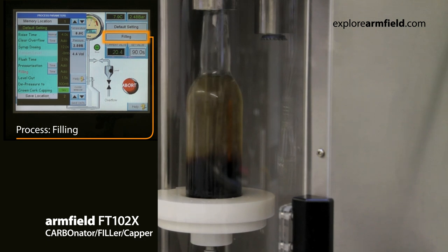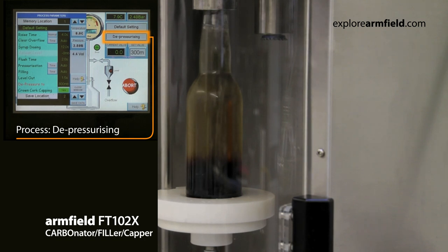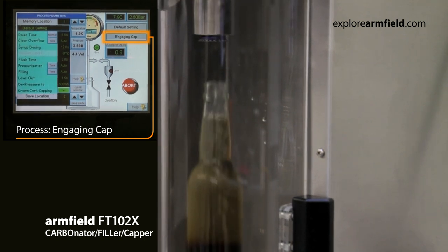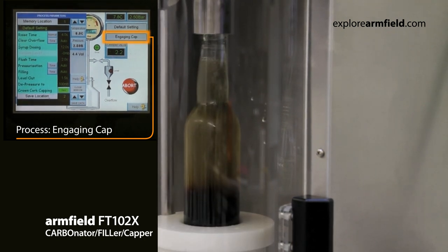The addition of the FT-104X Filler Kappa Counter Pressure Filling Station provides a second filling head for your R&D setup. The second filling head gives you the added versatility to fill two containers simultaneously, thus increasing output of product samples, or to fill two different container types — such as PET bottle, glass bottle, or can — in any combination you choose.